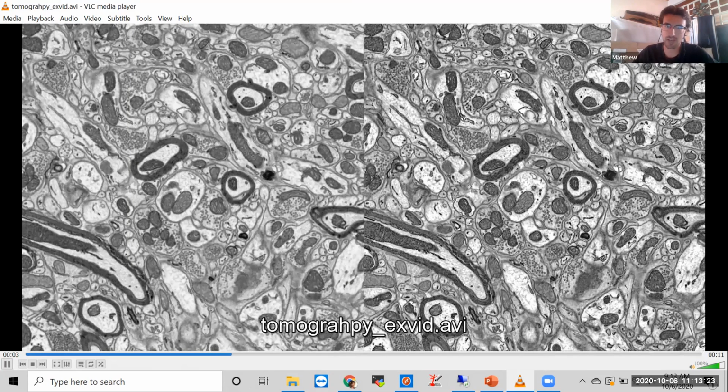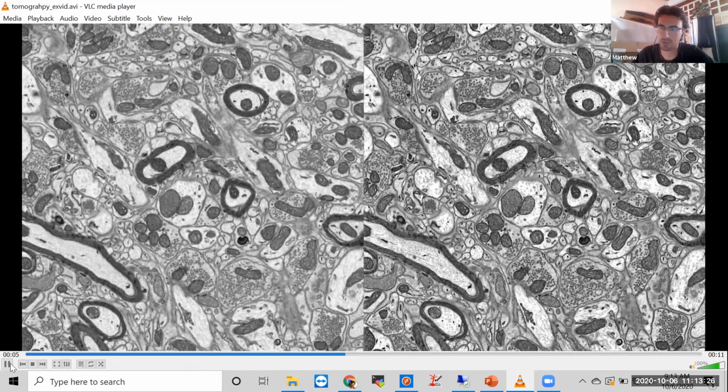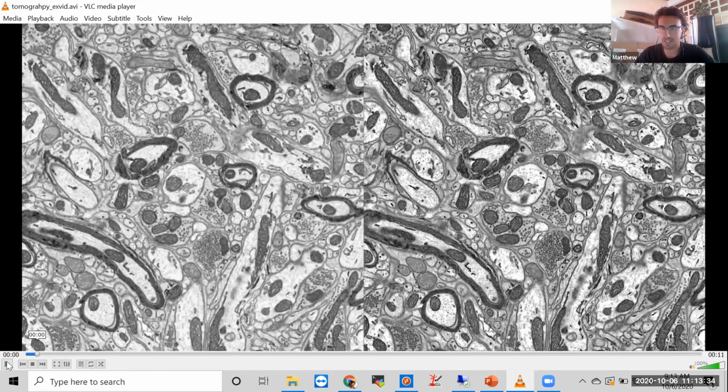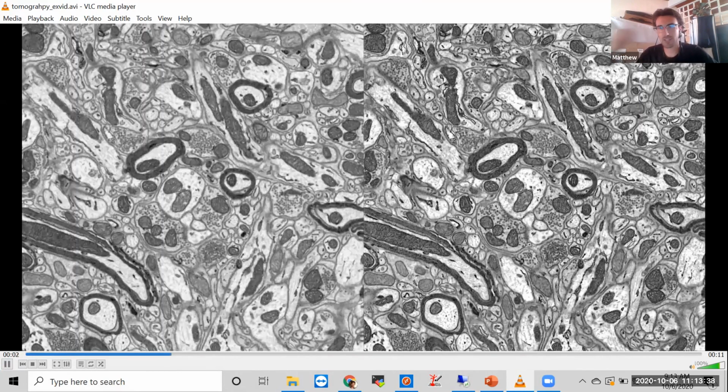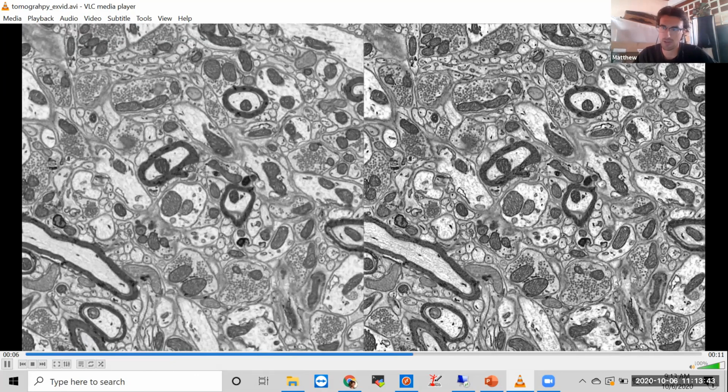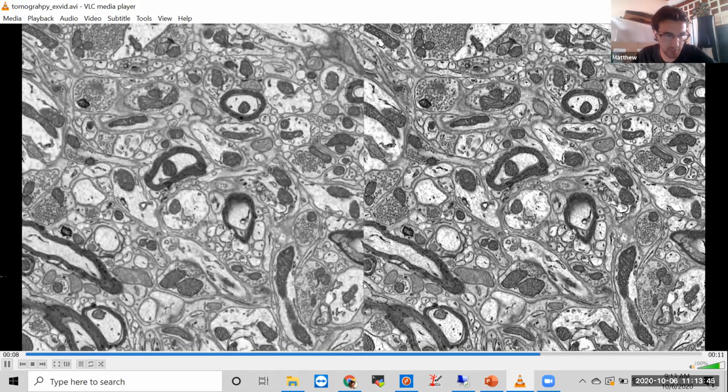And you can imagine that this is where the scaling problem really comes in, because what if you had a terabyte data set and your Z resolution is 10 times less than your XY resolution? Well, you could fix that with the AI, or at least let it give you these artificially enhanced ones, but you'd end up with 10 times more data, as well as intermediate data that is very complex, highly dimensional, and requires this Parsl data scheme I've been using.